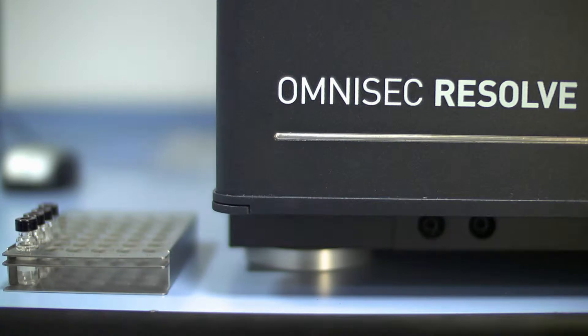With OmniSec Resolve, what we've done is separate and integrate all the chromatography side of things, so the pump, degasser, auto sampler, and column oven, all together to consolidate all the separation side.